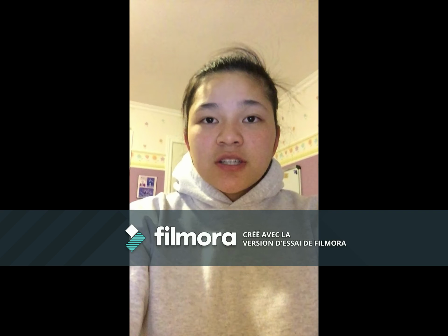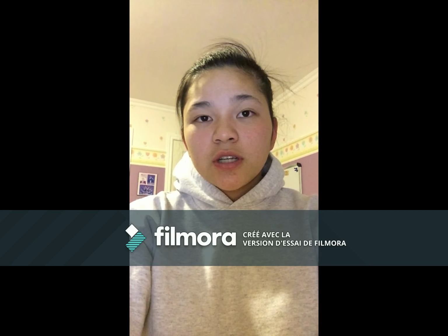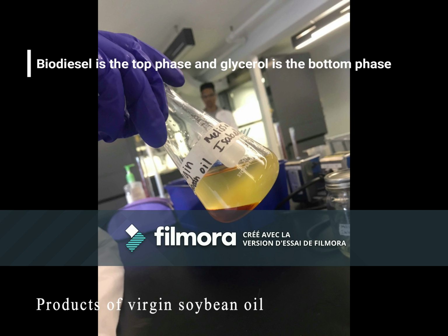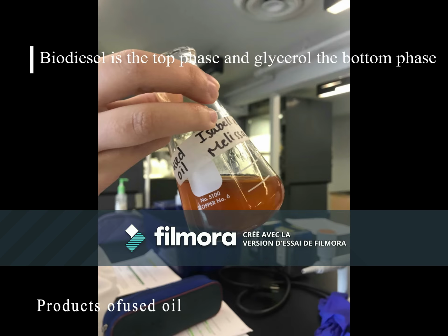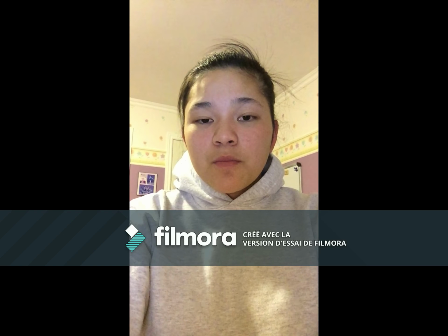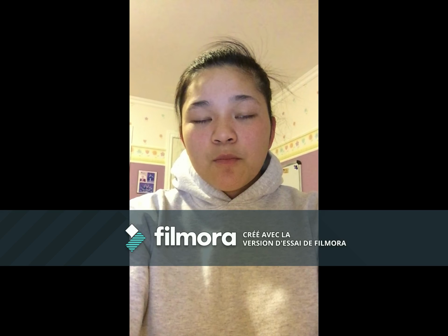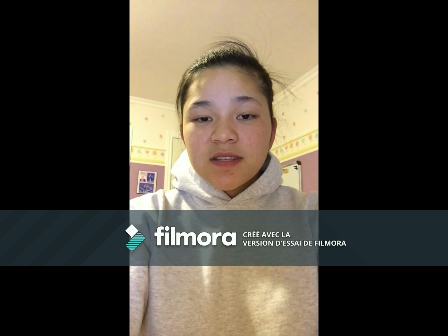Following the manipulations, I discovered that the biodiesel formed the top phase of the solution because the density of biodiesel is 0.88 gram per ml, while glycerol's density is 1.25 gram per ml. Thus, the substance with the smaller density is on top.